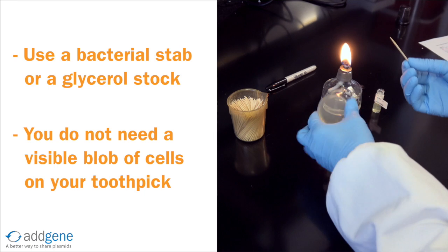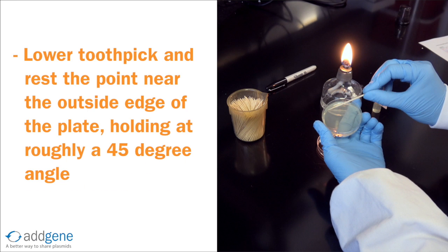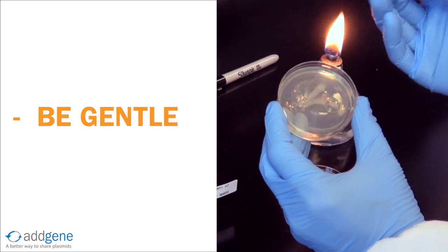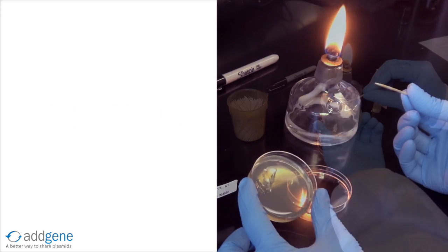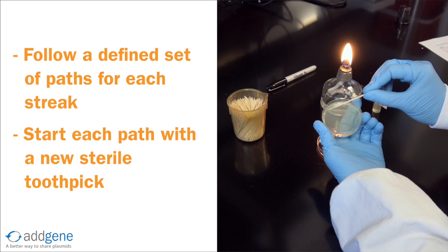With the tip of the toothpick now covered in bacteria, we can begin streaking. We lower the toothpick and gently rest the point near the outside edge of the agar plate, holding the toothpick at roughly a 45 degree angle. Be sure to be very gentle and not to stab the plate with the toothpick, or you'll dig up some agar during the streaking process. We'll follow a defined set of paths for the streak, remembering to start each path with a new sterile toothpick.